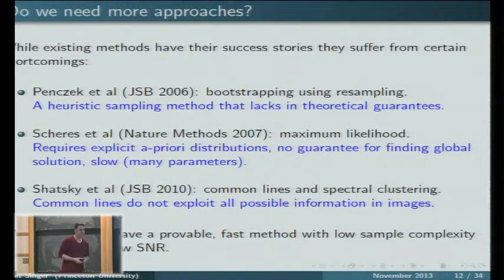You use the word volume to mean shape? By volume, I mean the electric potential phi of x, y, and z. Oh, that's potential. Right. In imaging, we usually call a volume a 3D array of numbers, because one has to discretize this function of three variables. So we call it a volume. Nothing to do with the volume of the molecule. No, it's not related to the actual volume. Yeah, so the terminology is a bit different.